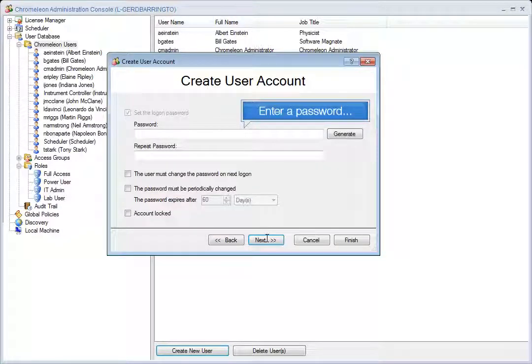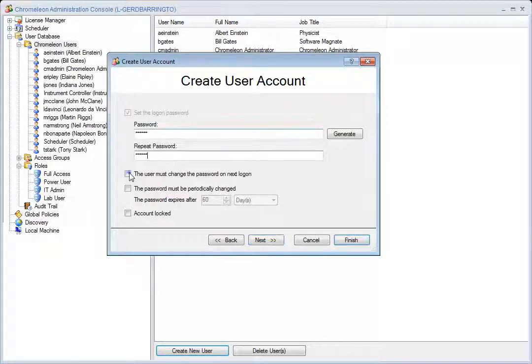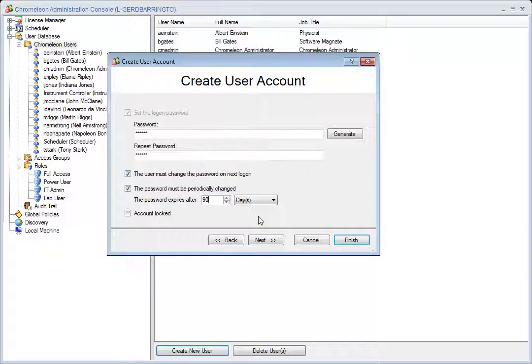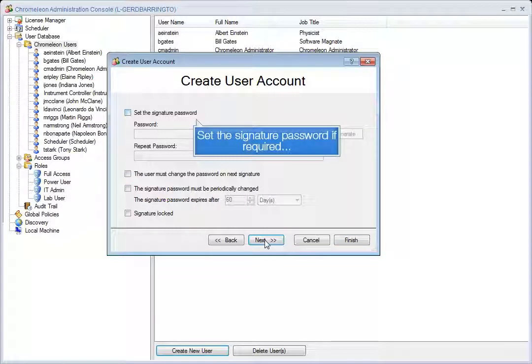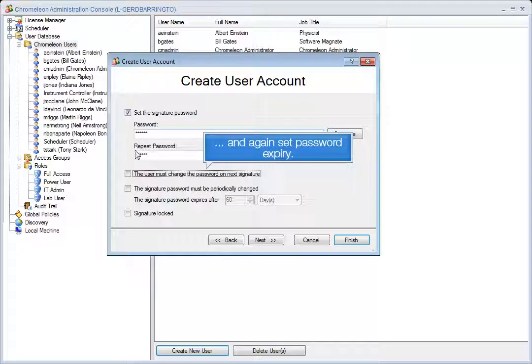Enter a password and set password expiry. Set the signature password if required and again set password expiry.